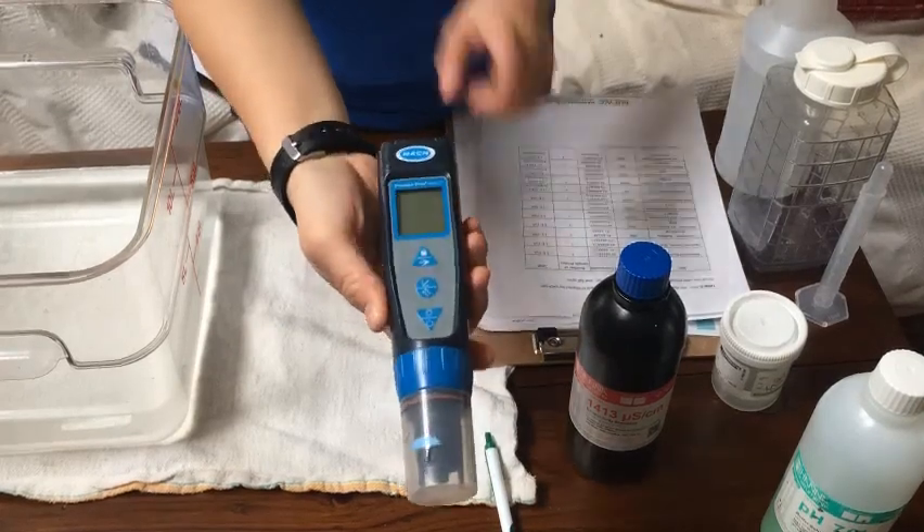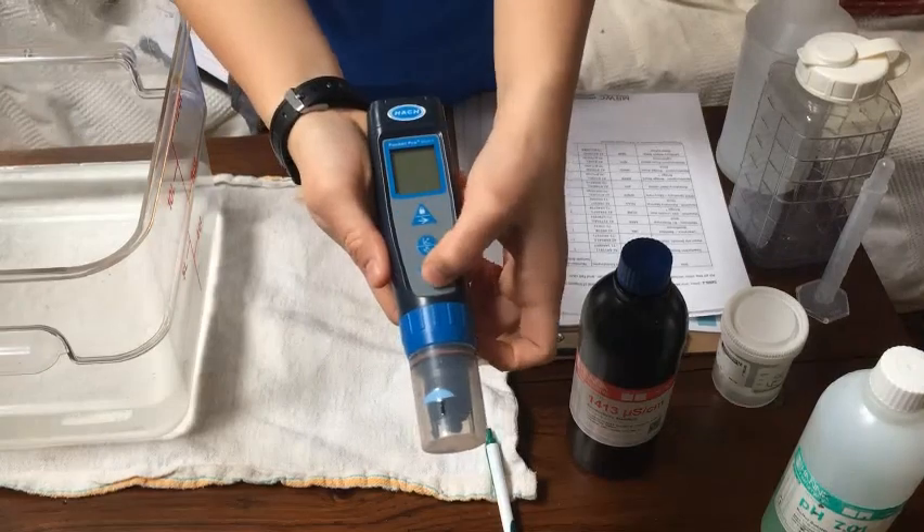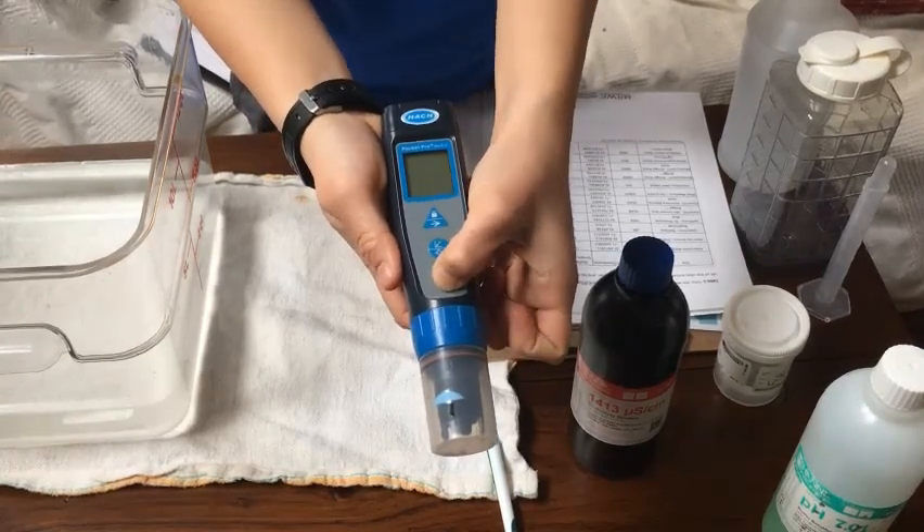To turn this on for calibrating, you hit the bottom button and hold it down until it lights up.